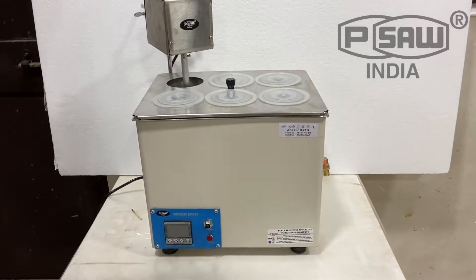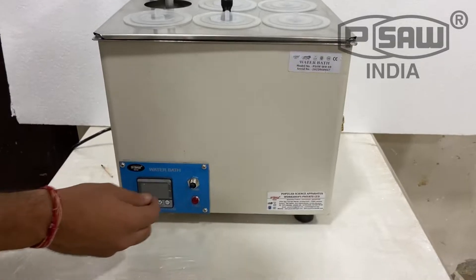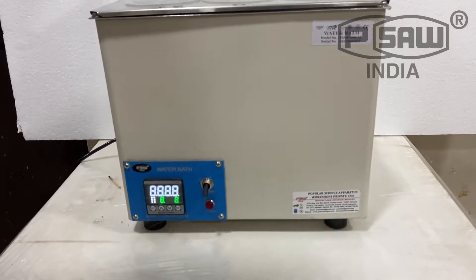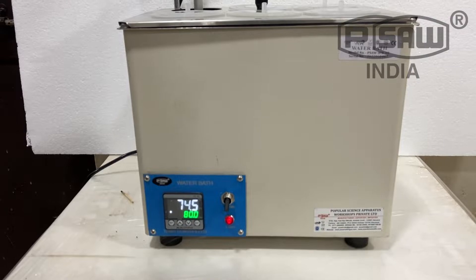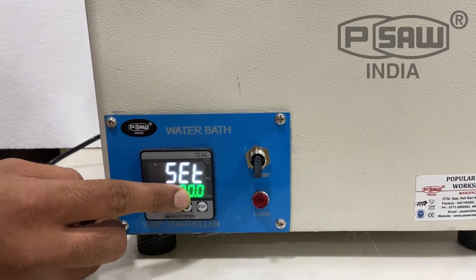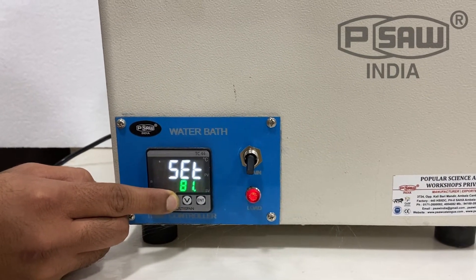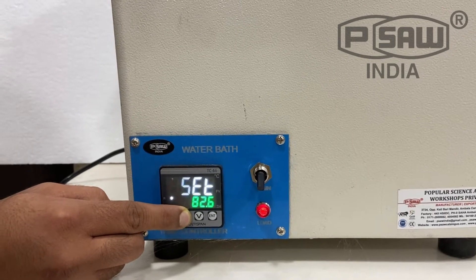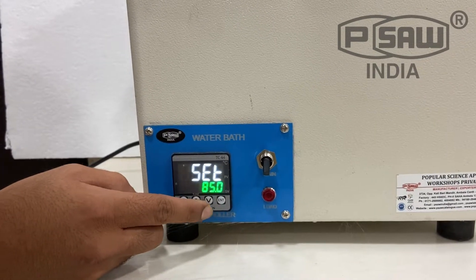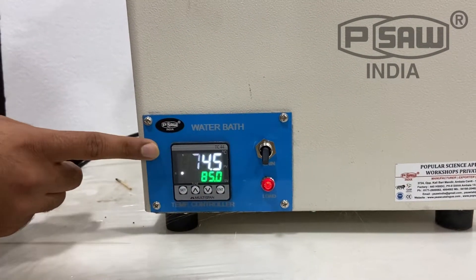This is the Pisa water bath model PSAW WB10 with a PID-based controller and circulating pump. Press the switch to start. For setting the temperature, press set — it is now set to 80. Press the up button; suppose we set the temperature to 85, then press enter. The load will start working, meaning the water bath has started working.